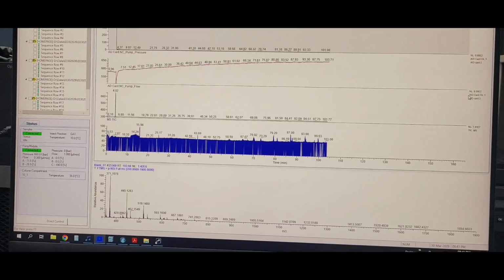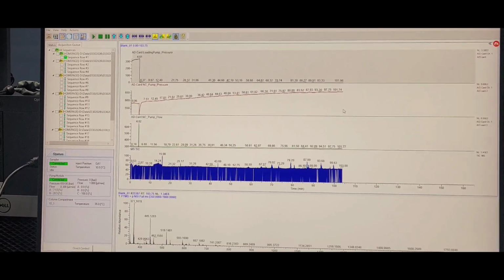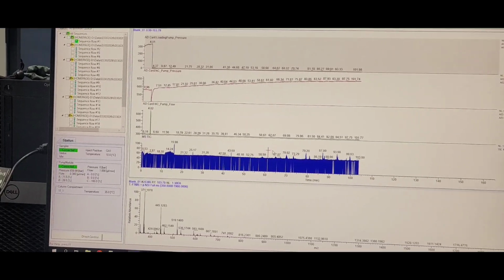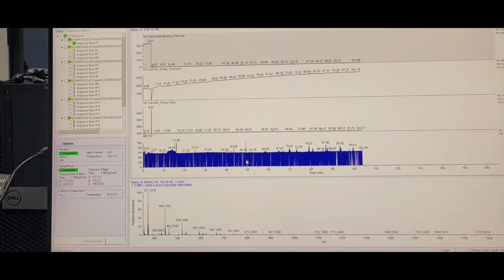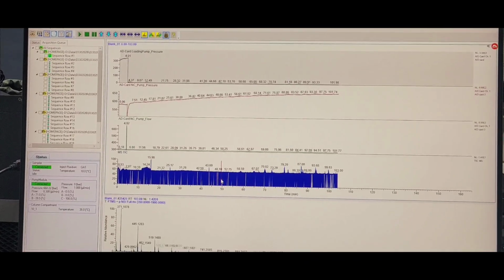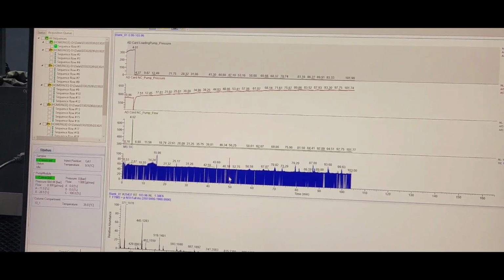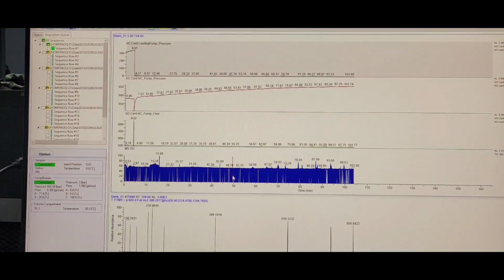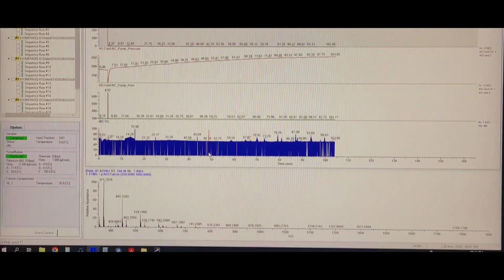So we can tell that the sample has good intensity and the noise level is very low. Here you can see, as the blank is running, there will be noise. If the same is seen in a sample, it means there was not good sample preparation.